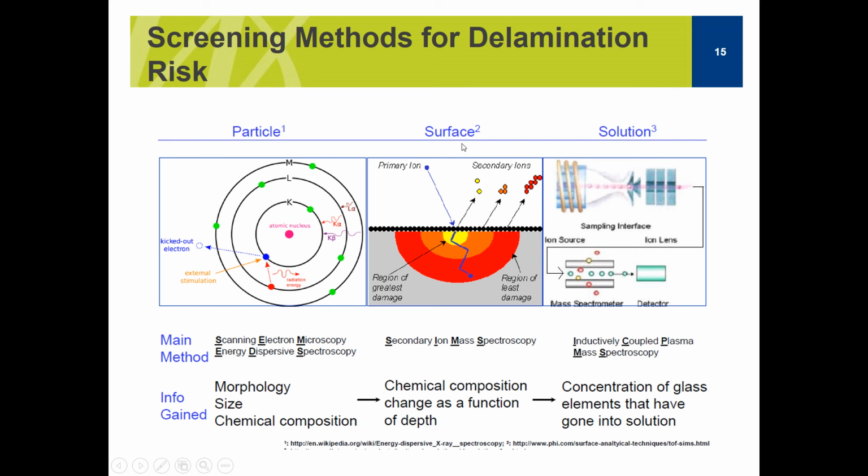Test mechanism number two is taking a look at the vial surface and seeing the pits. So if it's not very smooth, that means some of that flaking off is going to show it, and you're not going to see a nice cohesive and flat surface.